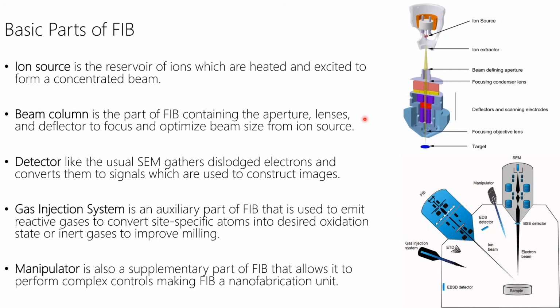And also these ion beams, they are also rastered, right? On the portion of the sample. Yes, correct. So similar to how the SEM electrons operate, the ions are rastered over a given portion of a sample.